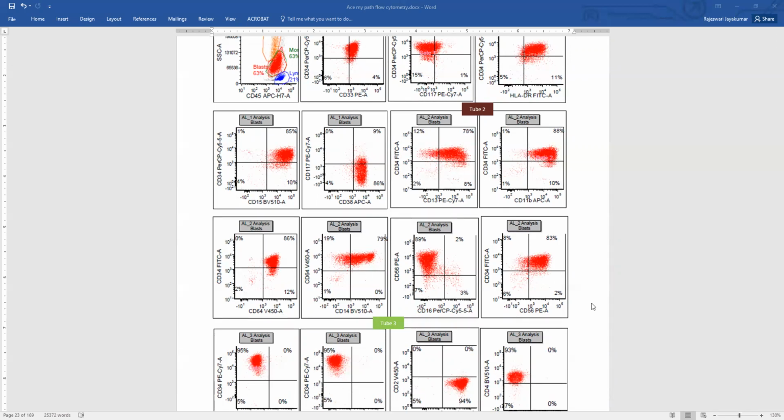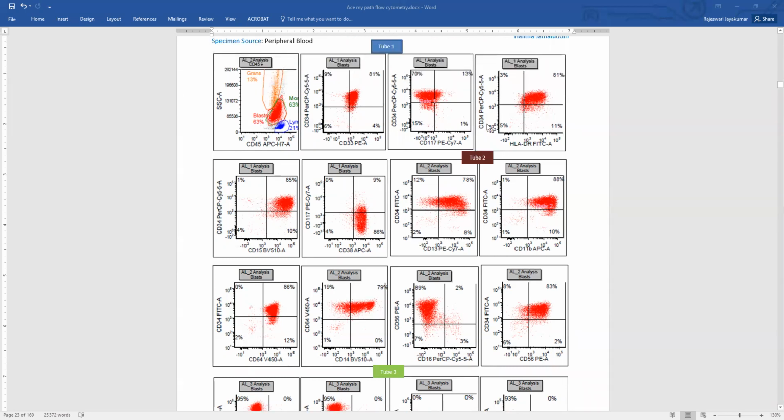So monoblasts, promonocytes, and mature monocytes can all be CD4 positive. So that helps. As far as HLA-DR is concerned, we usually consider it an immaturity marker. It will be positive on myeloblasts, lymphoblasts, etc. But even mature monocytes express HLA-DR. So when we consider monocytic lineage, HLA-DR is positive in all the monocytic lineage cells, both immature and mature. So HLA-DR positivity does not make it immature. But CD34 is still an immaturity marker.